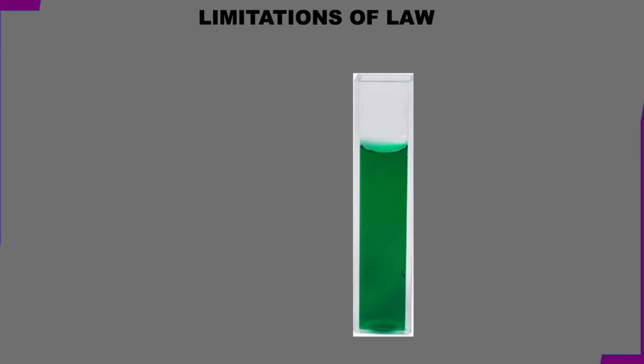Now we see that transmittance and absorbance cannot be measured as such with a solution just in a container. So we need to take the solution in a proper container, called the sample holder, and technically it is called a cell or a cuvette in UV visible spectroscopy. Cuvettes are made of quartz or glass, and nowadays some polymer based cuvettes are also used. When we use a glass cuvette, there ought to be some reflection and scattering of light also, and these reflection and scattering losses can occur at the cell walls or the wall of the cuvette.